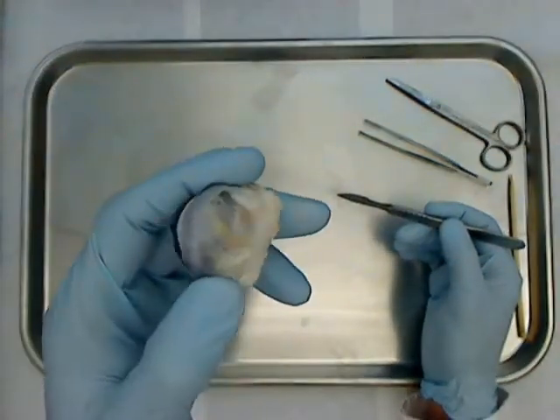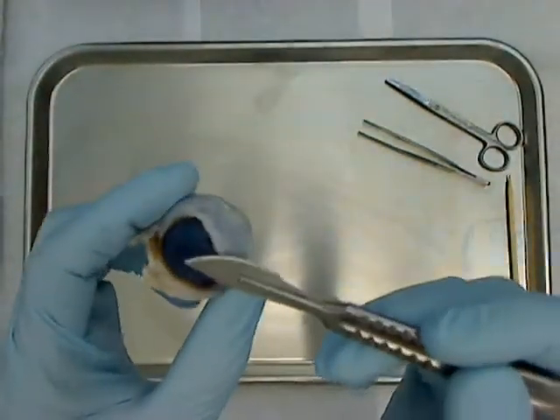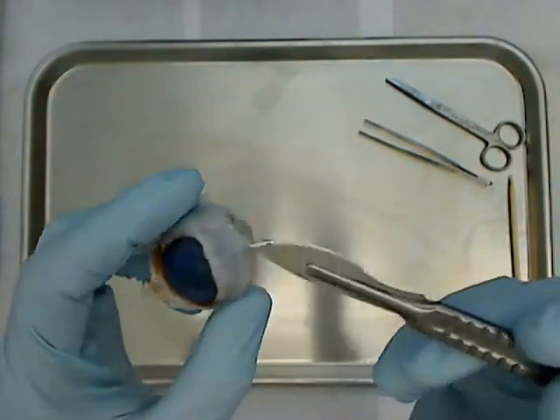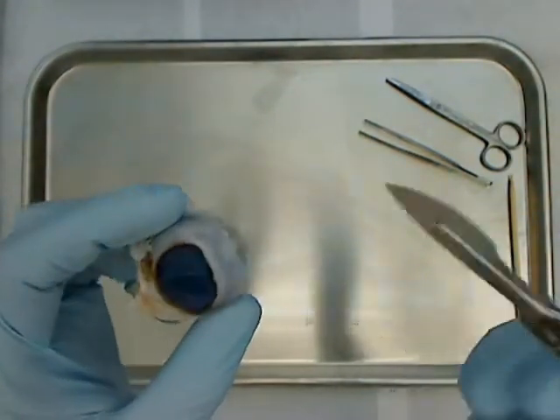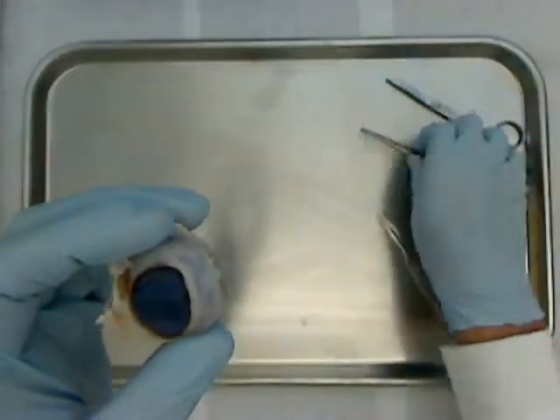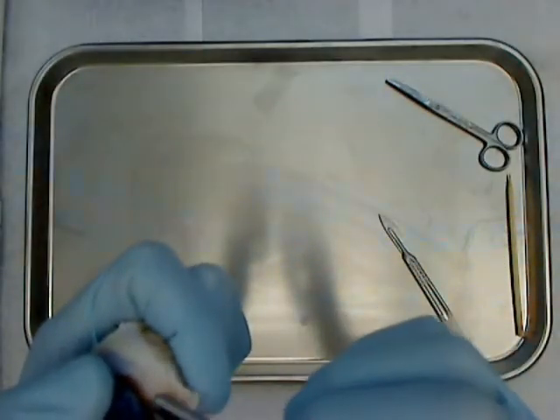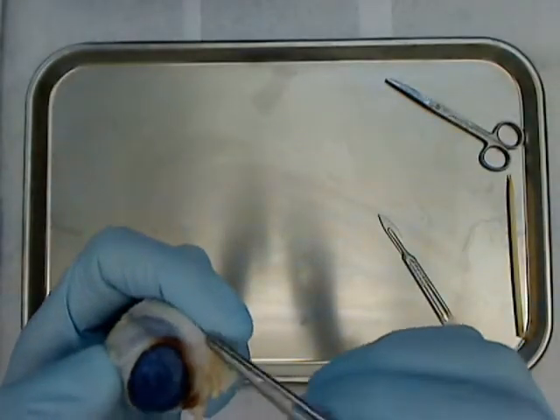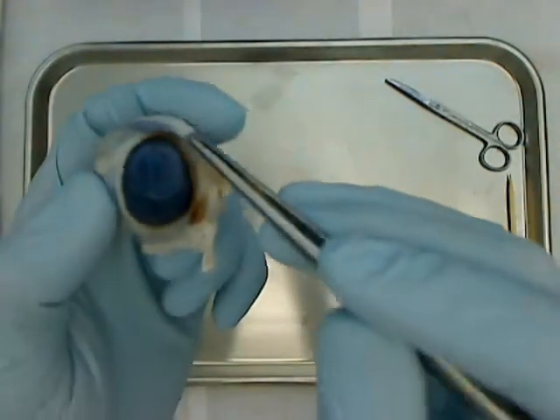This is the outside of the sheep eyeball. In the front we have the cornea. The white part is the sclera. If I grab my forceps, I can pull on some of this tissue out here. This softer, more flexible tissue is called the conjunctiva.